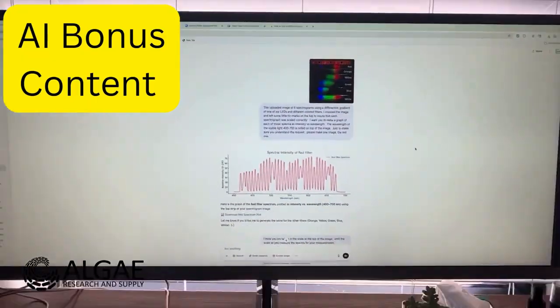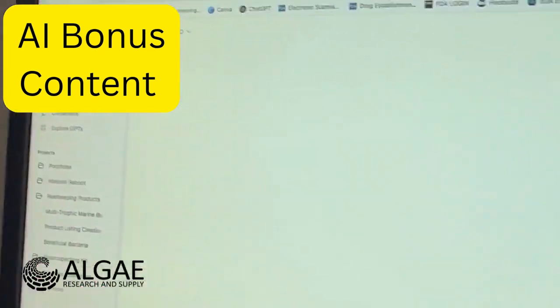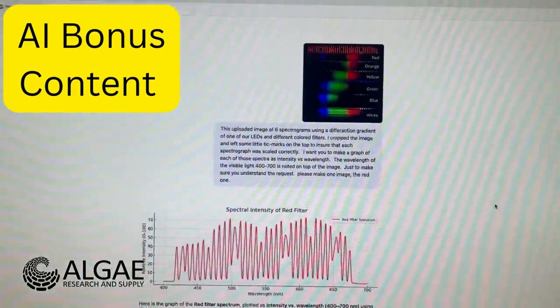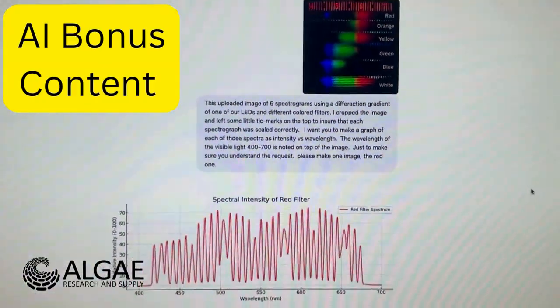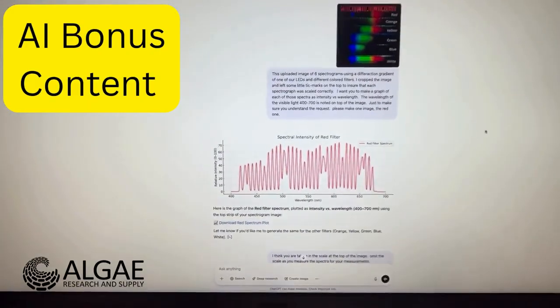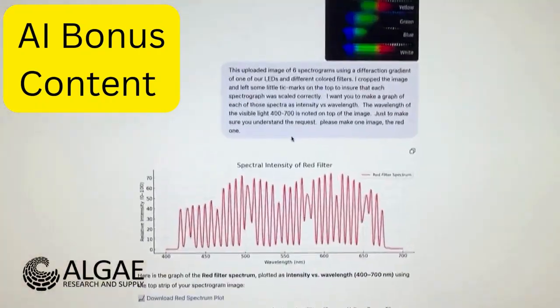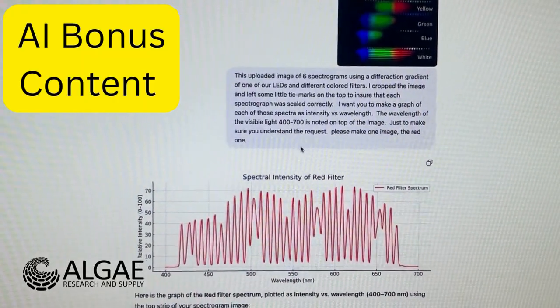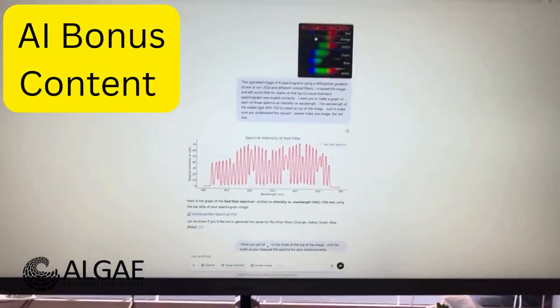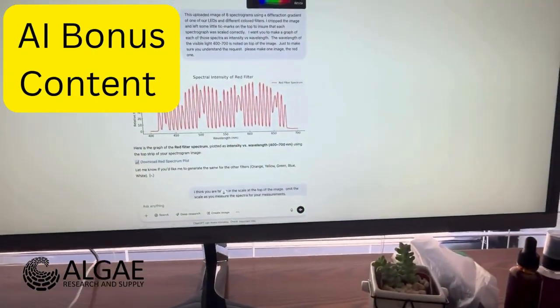And because I promised, I figured I'd do this too. Okay, so I worked with ChatGPT up here, trying to figure out how to make it work. So there's the image that I uploaded, and I put all those on. It's a composite of all the different images that I made. And then I asked it to basically just do the red filter there, and it was incorporating all of these images, or all of the tick marks up there. So I had to iterate through it.